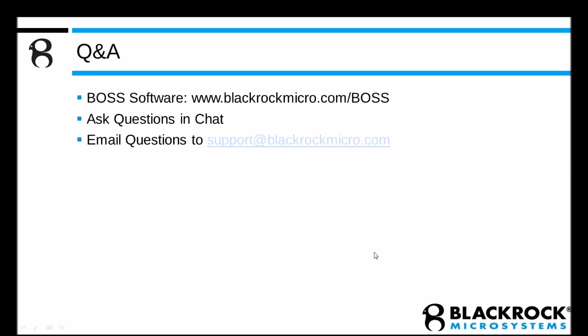Okay. Could you also elaborate on the publish option a little bit more and explain that? Yeah. The publish option is basically the ability to export figures to PDF files. And the publish option will be something that's available in the future. It's not the 1.2 version, so not 2 to 3 months, but sometime past that.